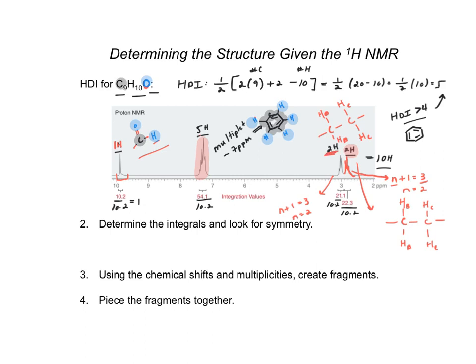So we'll call this HB, I think that's what I called it down here, HB, HC, HC, right? HC, which would probably be, we'll call this guy, is going to be near that aldehyde. So aldehydes have to end structures because hydrogen can't bind with anything else, right? So we knew that we had this aldehyde group. We knew it was going to be a terminal position. So this guy has to be an aldehyde group, and we know it has to be terminal. So HC is probably this guy because of that. Again, aldehydes don't couple, so we don't have to worry about that.